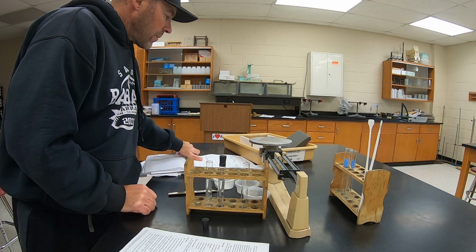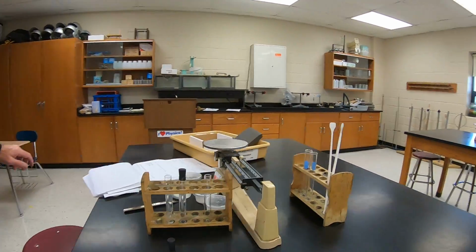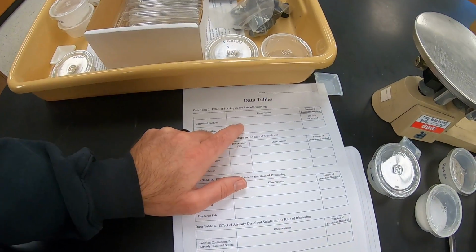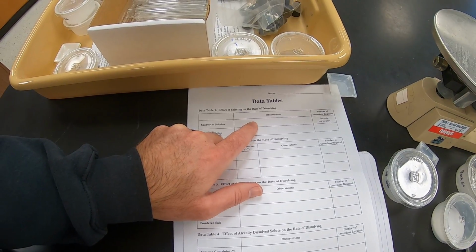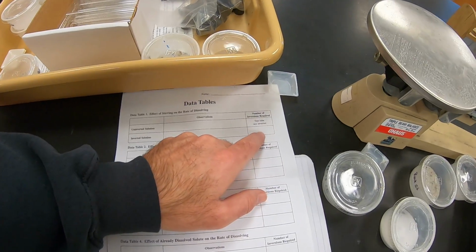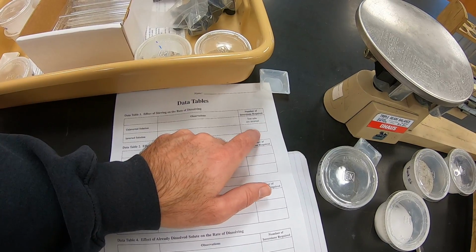So on this table, what you need to put, the uninverted solution, it took a long time to dissolve. The inverted solution dissolved very quickly, and the number of inversions, we're just going to put the number that it took, which was 3.